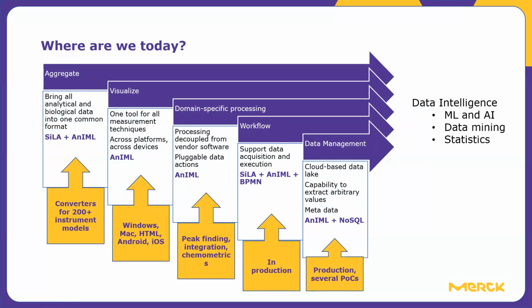And all of that data then needs a home, which is a cloud-based data lake, where we also have the capability to extract arbitrary values, where we have a solid metadata strategy, where we combine the AnIML format plus a scalable NoSQL architecture to ensure that that data can be represented and navigated and searched efficiently.